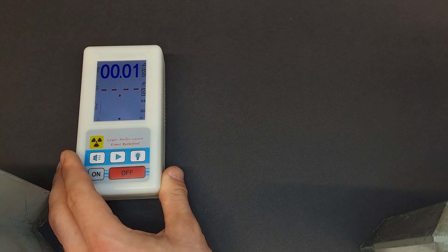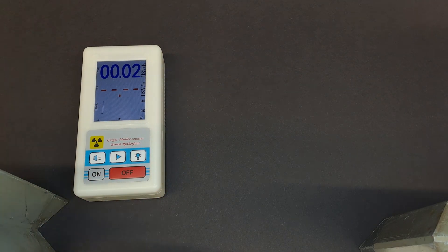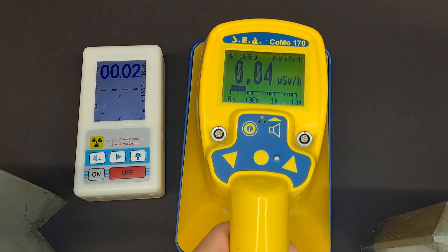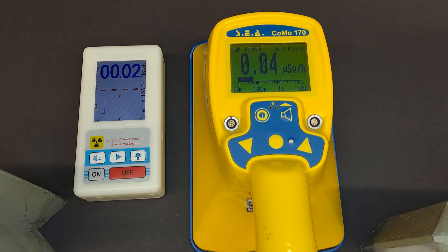A video that brought me a very important realization. Let's compare a cheap dose rate meter with a professional one used in our laboratory.